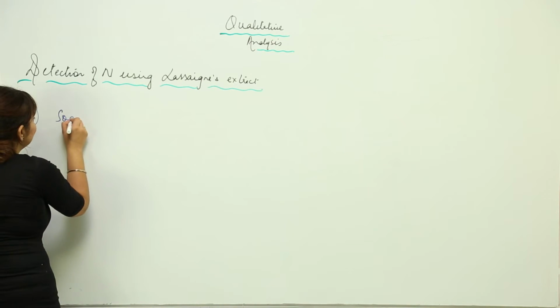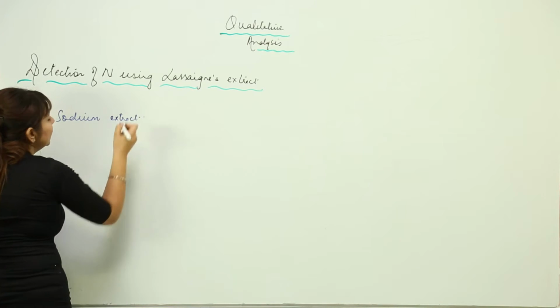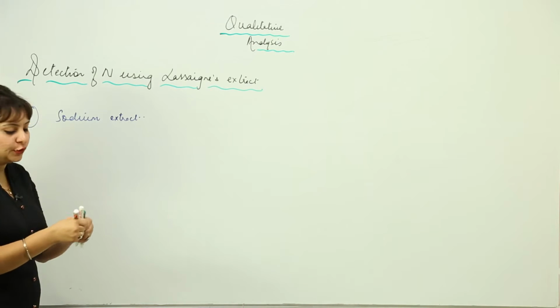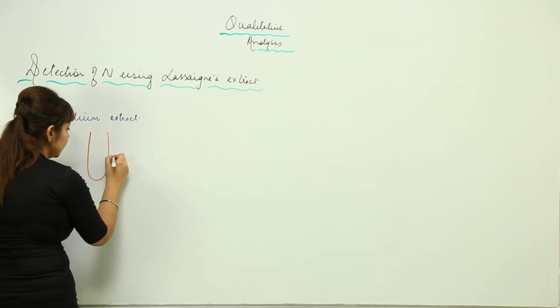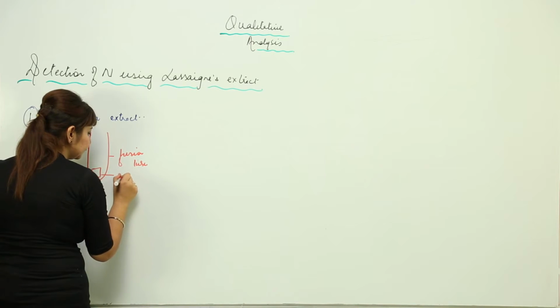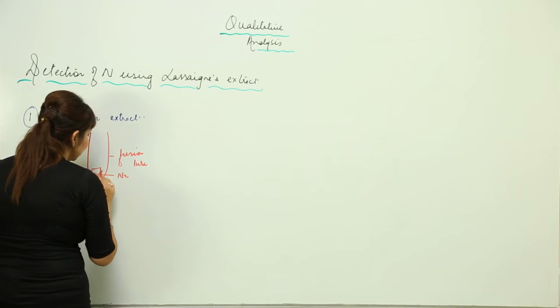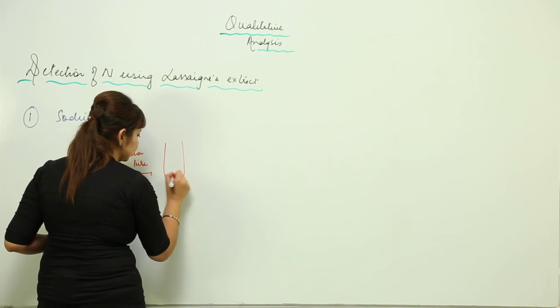You can also call the Lassaigne's extract the sodium extract. So the first thing is that we need to prepare the sodium extract. Just look at the board to see how we do it. We take a fusion tube, right? So this is my fusion tube. We take a piece of sodium in it. We heat it a little, so that this sodium actually melts. So let's say this sodium is melted.